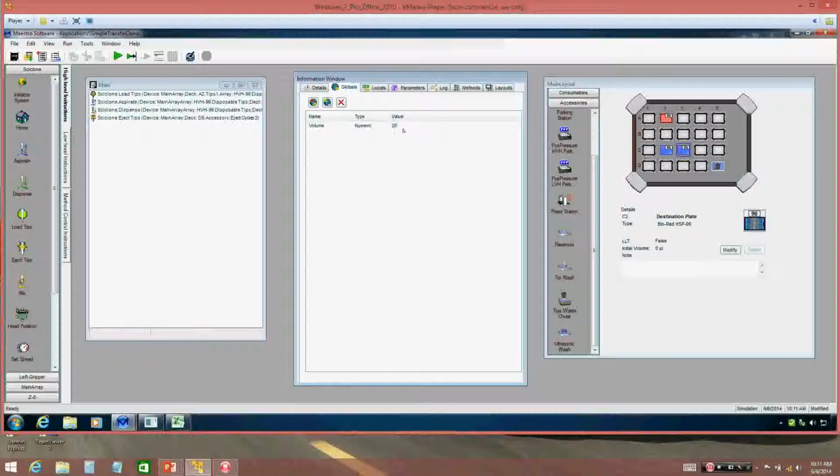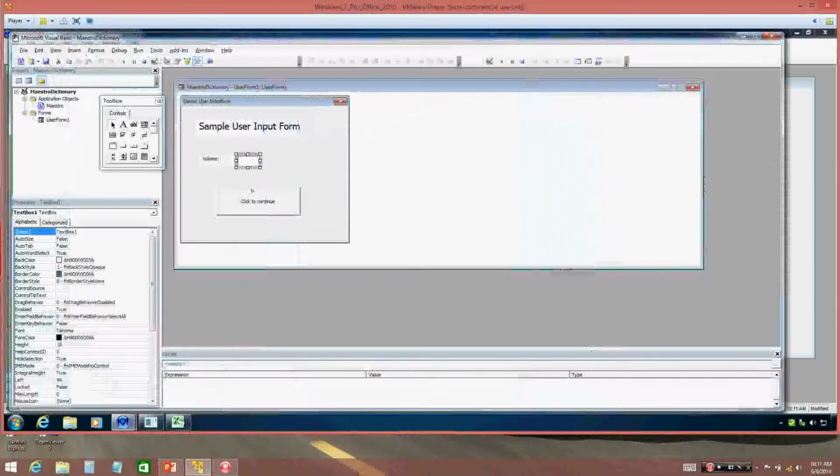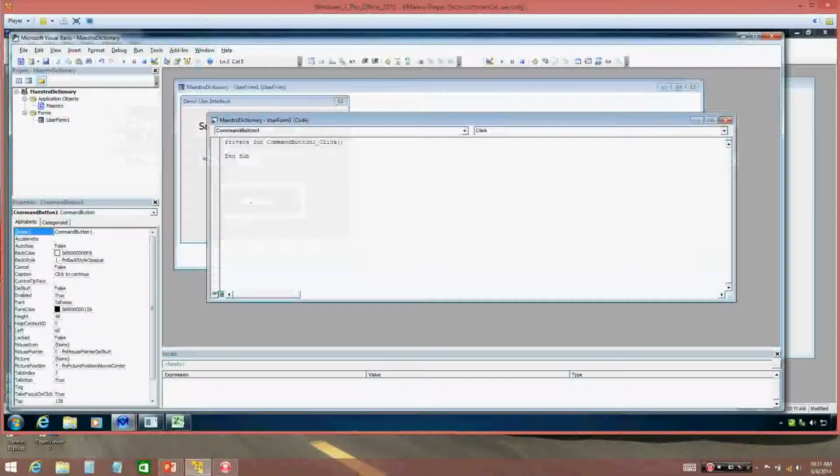This box that's selected over here, when I click on it, it says text box 1. So when I double click this code over here, there's actually one line that you really need to write down. There's nothing too special about it. You can write it down, and I've had a lot of users honestly surprise me and create these amazing interfaces. So this one I'm going to type Maestro, and when I hit a period over here, there's something called IntelliSense. So I'm going to say set global variable value, because we set a global variable value.